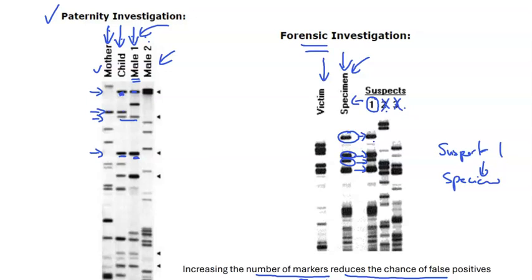Notice that this technique relies on the amplification through PCR before the gel electrophoresis can actually be carried out. The samples at a crime site are small, and they are amplified through DNA polymerase techniques so that gel electrophoresis can then be used to find the associations.